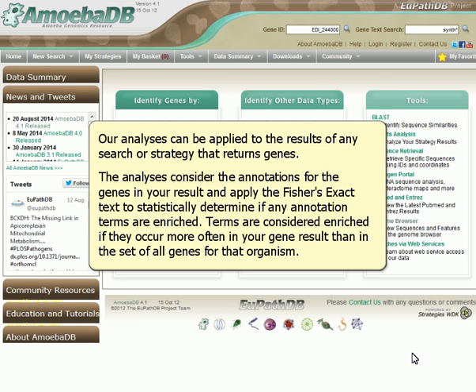Our analyses can be applied to the results of any search or strategy that returns genes. The analyses consider the annotations for the genes in your result and apply the Fisher's exact test to statistically determine if any annotation terms are enriched. Terms are considered enriched if they occur more often in the gene result than in the set of all genes for that organism.